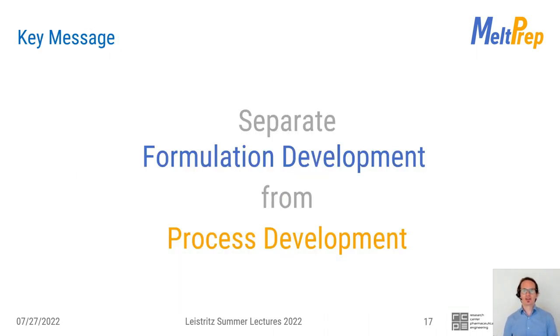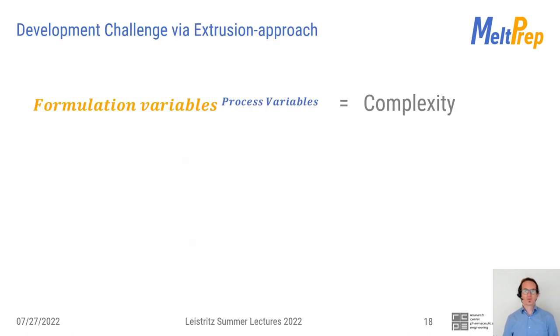I have one key message before we move on to a few case studies. VCM allows formulation development without extruder process development. Why is this important? Let me illustrate. When we perform a conventional HME-based formulation approach, we have to cope with a complex problem. In math, this could be expressed by an exponential expression. Since the pandemic, we are all a bit tired of looking at the exponential growth of a curve.